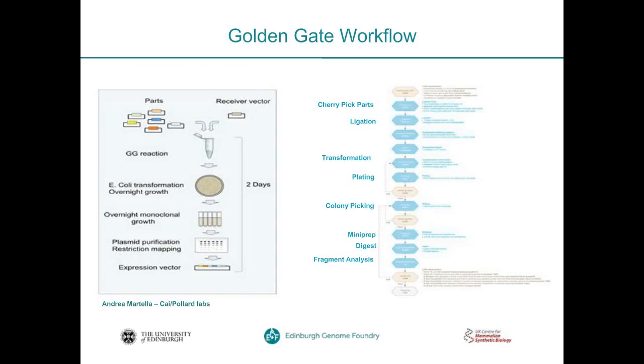Thank you very much, Heather. So my name is Ivan. I'm the application specialist here in the Edinburgh Genome Foundry. What that actually means in reality is that my job boils down to translating the science that the foundry sets out to do into actual robotic operations so that the instrumentation that we have can actually do it. And this includes the Molecular Devices QPix, that I will talk about in a little bit.